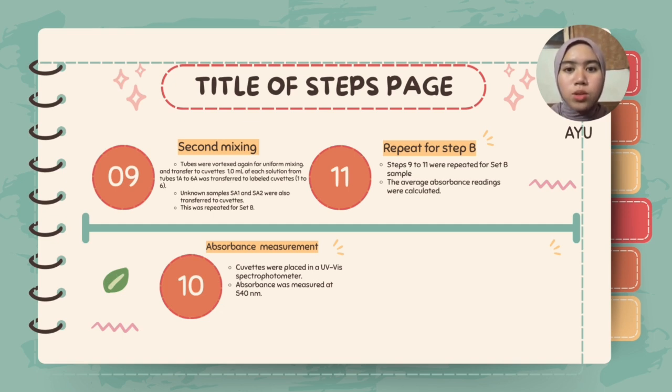Steps 9 to 11 were repeated for set B samples, and the average absorbance readings were calculated.